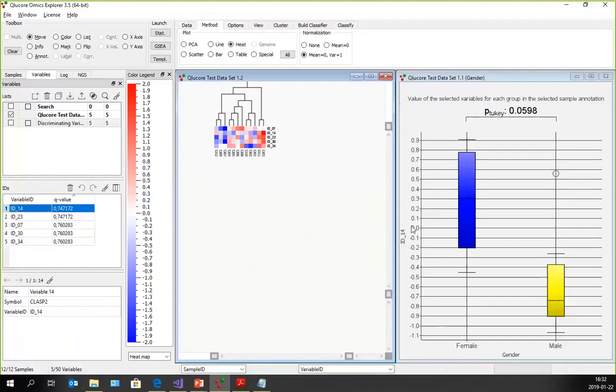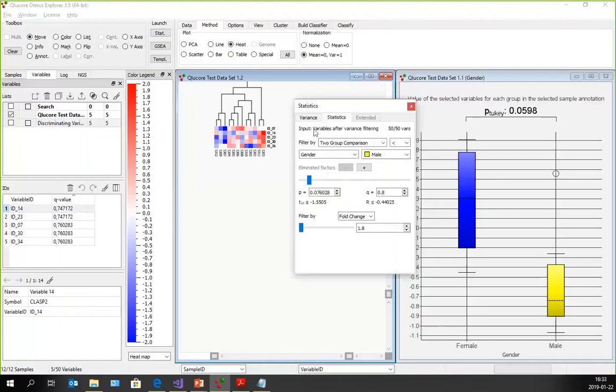So with this tool, you can basically build any sort of plot setup, any sort of data analysis setup. In this first version of templates, not exactly everything in Qlucore Omics Explorer is controllable, but many things are. One of the most important things that you can control with this is the, let me see here, it's on my other screen. Sorry about that. It's the statistics dock window. Everything you can do in this window, which is your basic interface for data analysis, can be done through the interfaces in templates.